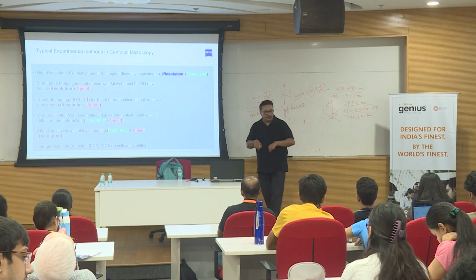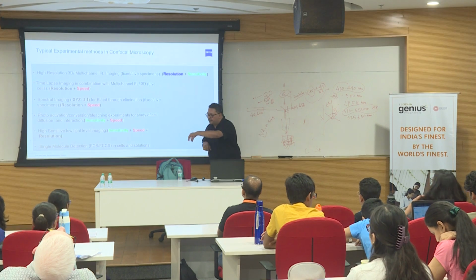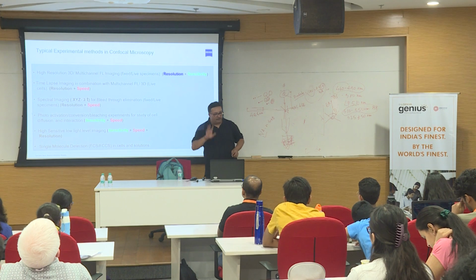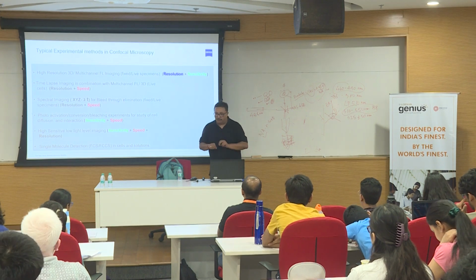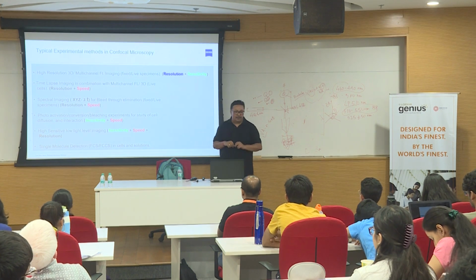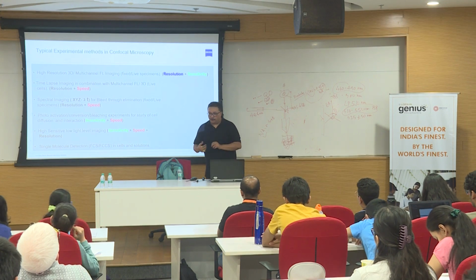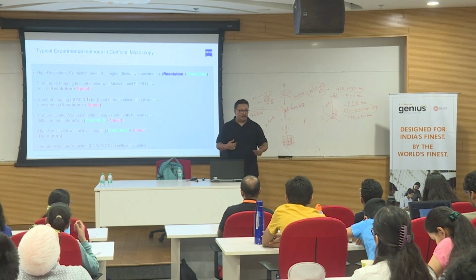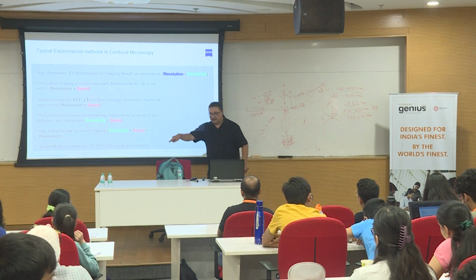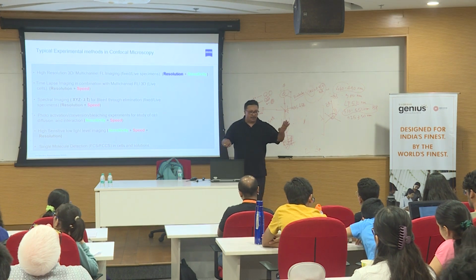So in a cell or in a field of view, suppose you have acquired a fluorescence image with 10 cells in that field of view. Each cell will have a different grayscale value, or different efficiency or quantum yield, depending upon the structure or the protein, and that is how you differentiate between the yields. In terms of quantification you will say, this is the brightest sample, this is the dullest, and this is in between, because I know the intensity and I know what my background is.